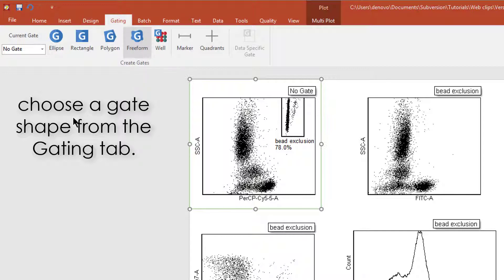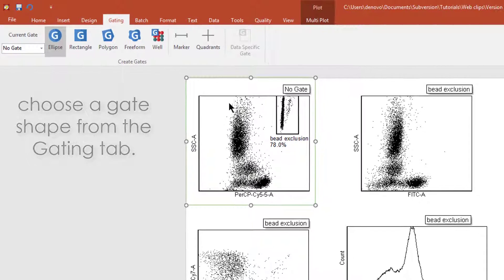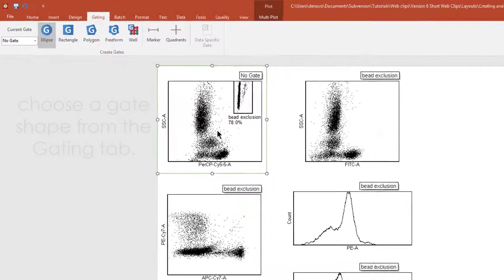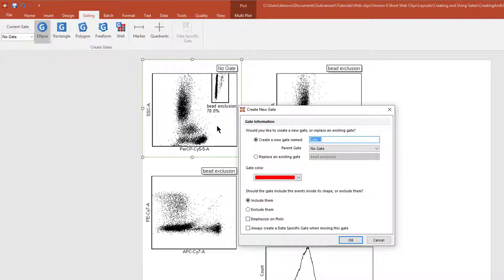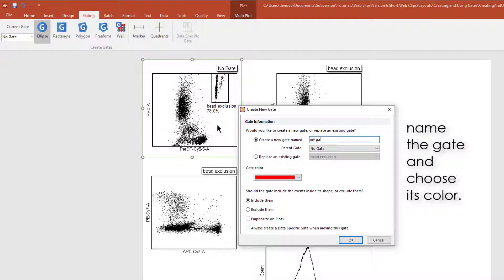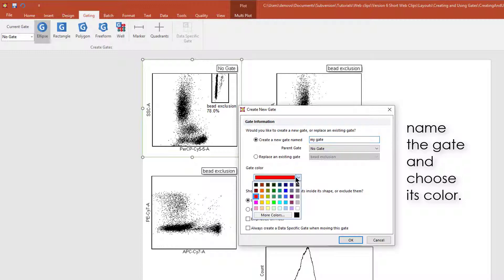To begin creating a gate, simply select the desired gate shape and draw it on your plot. Give the gate a name, and if desired, choose its color.